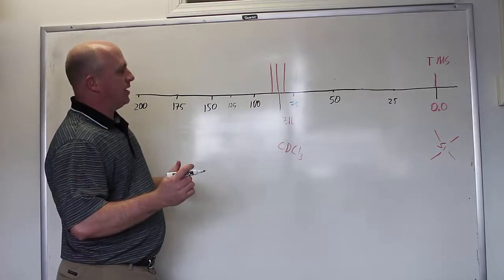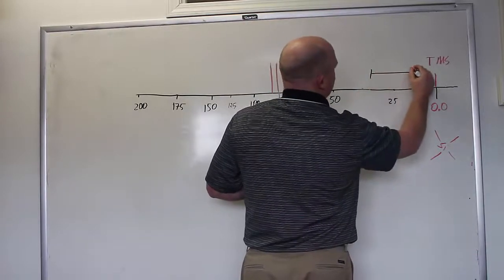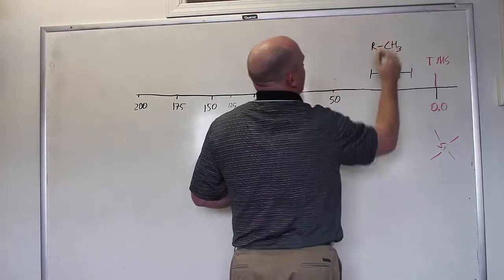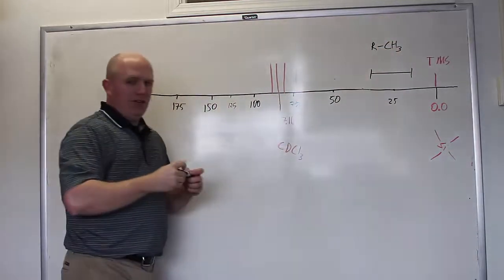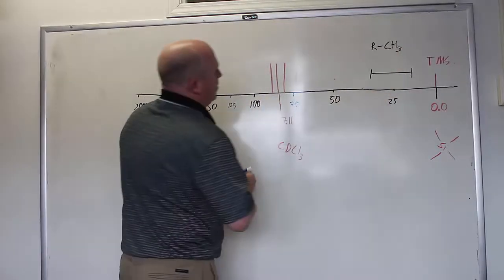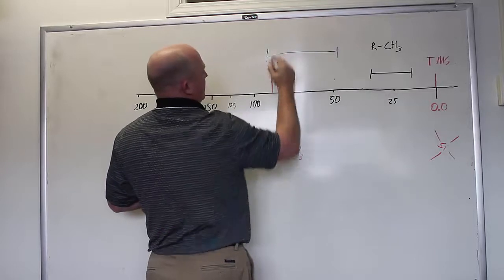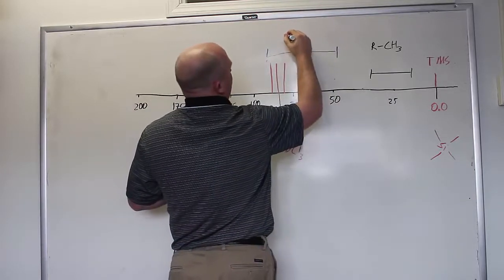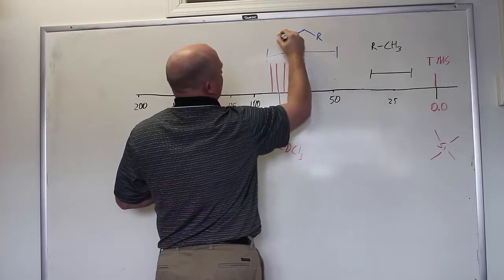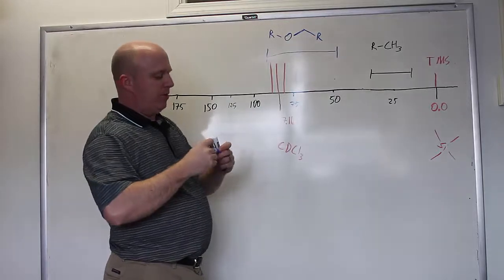The interesting ranges in carbon NMR, essentially down in this 10 to maybe 30 range, are things like methyl groups at the end of a chain, or other boring stuff. Generally between 10 and 30, alkyl chain sort of thing. Between generally 50 and maybe 80 or so, 90, somewhere in there, that's when you have an oxygen. So you'll have a carbon that's bound directly to an oxygen or nitrogen or chlorine, fluorine, something like that.